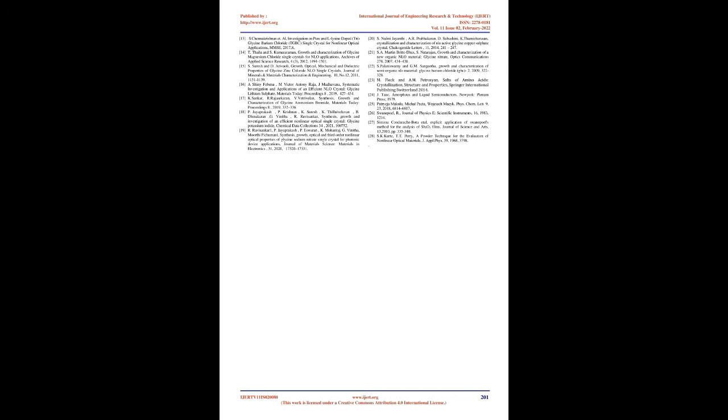For a direct band gap crystal, the optical band gap energy, Eg, can be calculated using the Tauc relation, α² = A(hν − Eg), where α is the absorption coefficient. The variation of α² versus hν in the fundamental absorption region is plotted in Fig 5, and Eg can be evaluated by extrapolation of the linear part 24, 25. The band gap is found to be 6.2 eV.